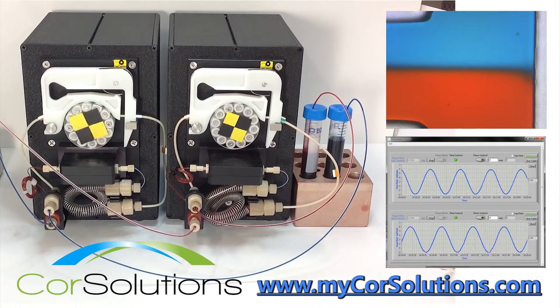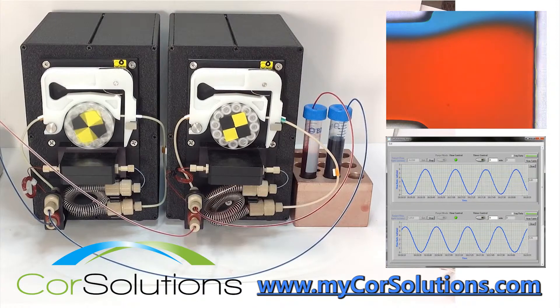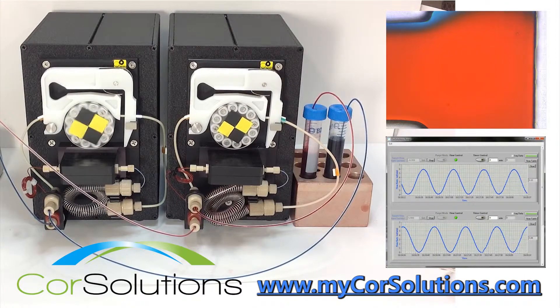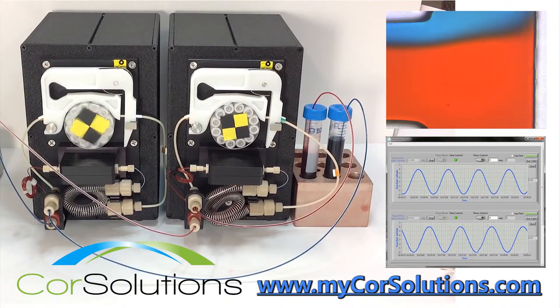Two Core Solutions PeriWaves can be used with Core Solutions probes and a laminar flow mixing chip for applications in flow chemistry reactions, fluid control for cell culture, and simply creating desired mixtures and solutions.